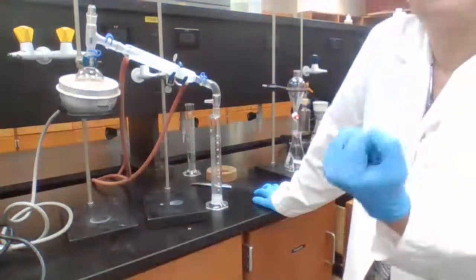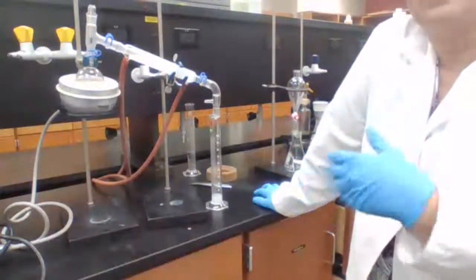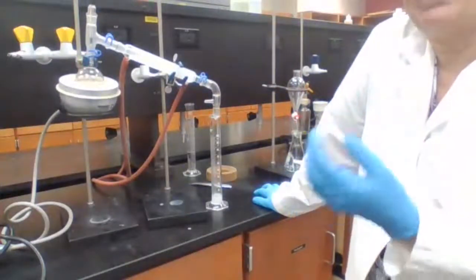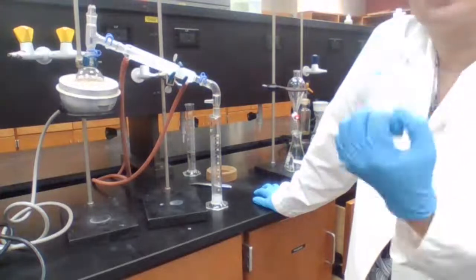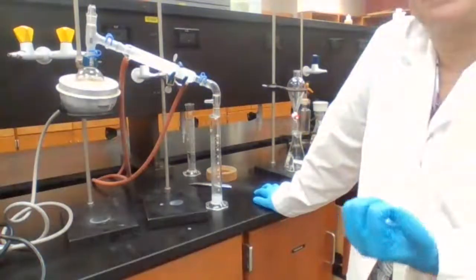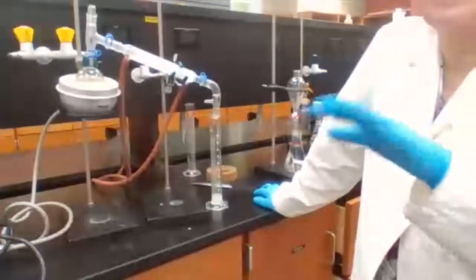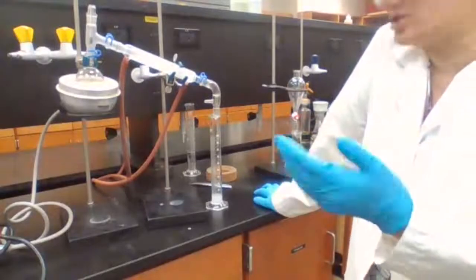Salt kind of draws out the water. So a salty aqueous solution is going to get as much water as possible from the organic layer, and then the organic layer becomes more clear or more distinct, so you could see the separation better.